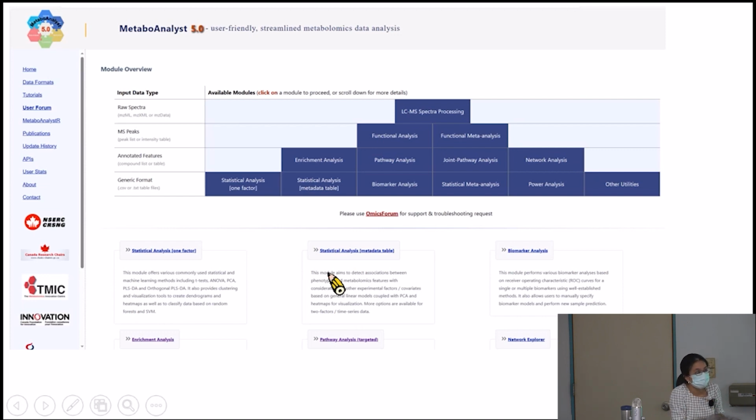No, I mean the same sample used in two different mass spectrometry units. One person is using liquid chromatography, another gas chromatography. Which one would be more realistic? Oh, I see. So there must be an advantage and disadvantage of using each.